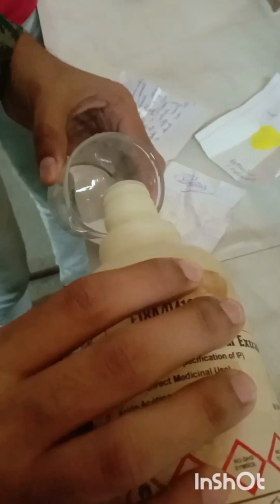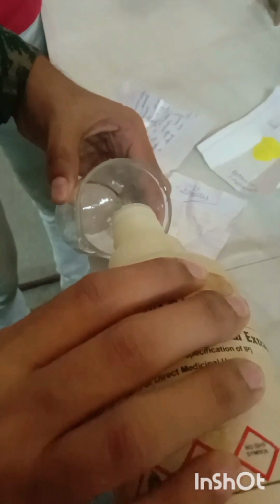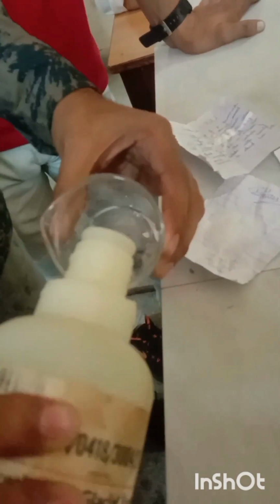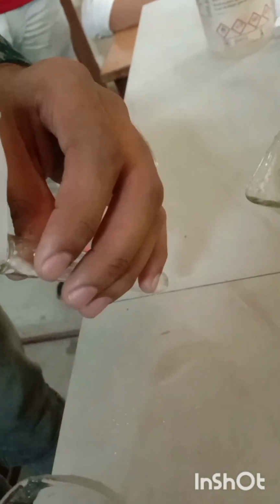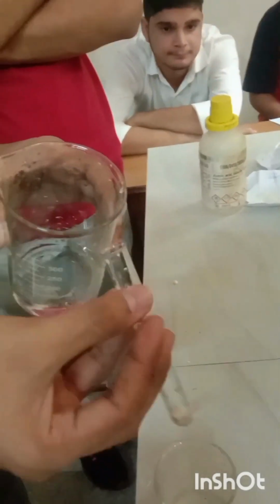And now take in another beaker a few ml of glacial acetic acid. Now we take glacial acetic acid in this beaker, and now we will take our insoluble sample in a test tube and add both the solutions in it.